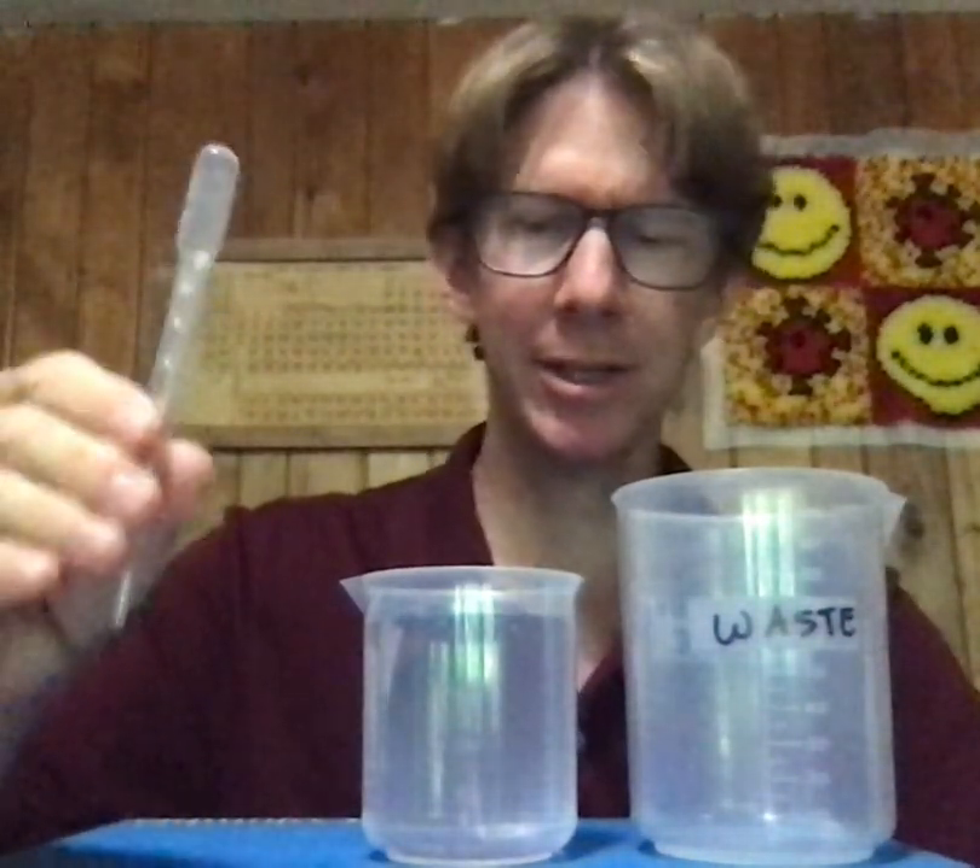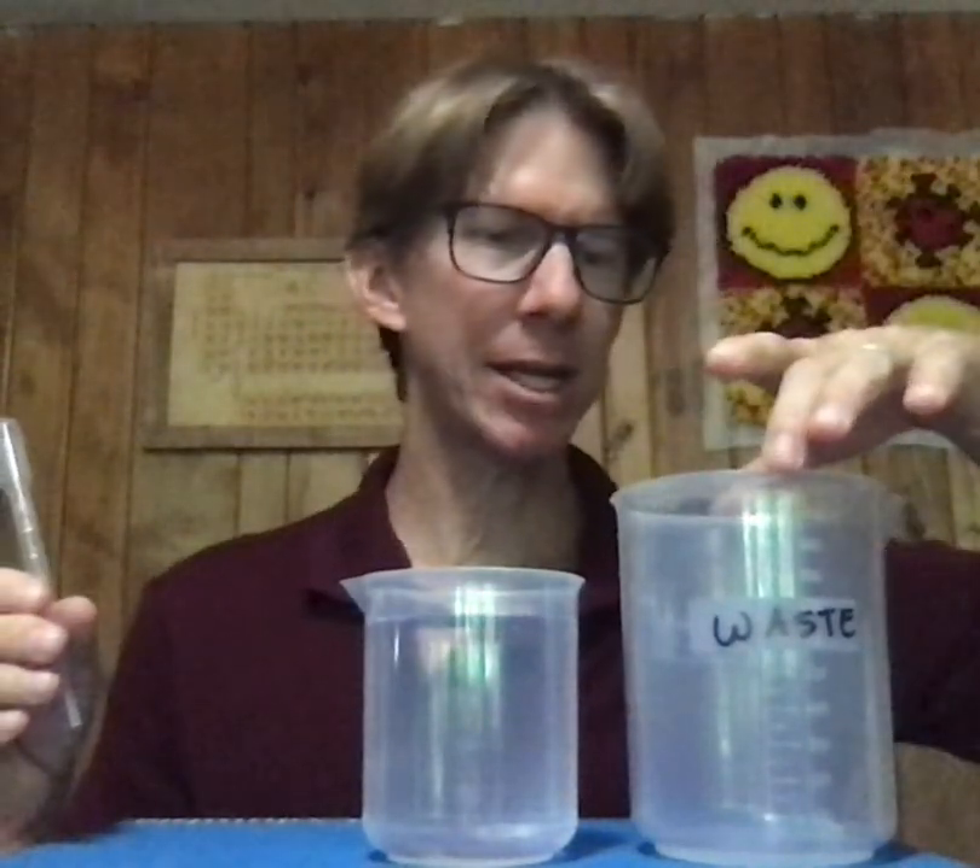This is experiment one, basic techniques: condition the pipette. I've got my pipette right here, I've got my equilibrated water, and I've got my waste beaker properly labeled right here.